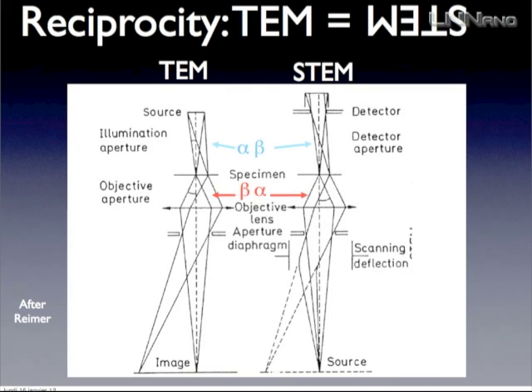Okay, so maybe I will say a word on this tomorrow, but just remember that usually it's HAADF that is the best signal to make your alignment. And then suddenly you put your bright field detector and you have a huge astigmatism. It's something very, very strange. And this can happen just because the detector is off axis.